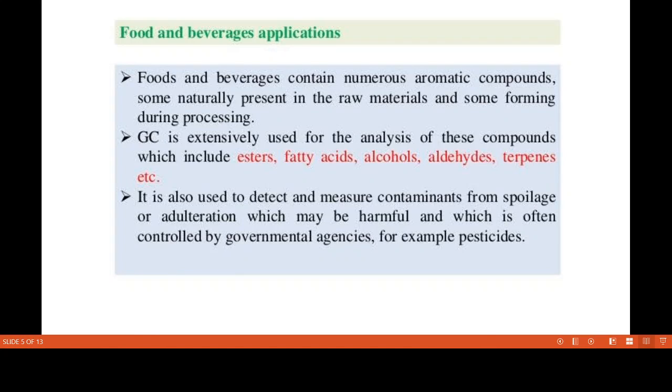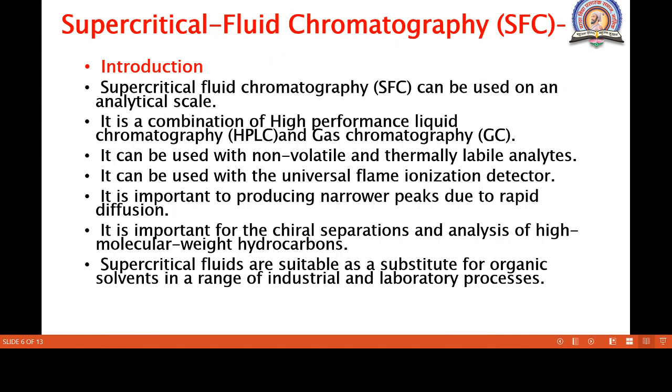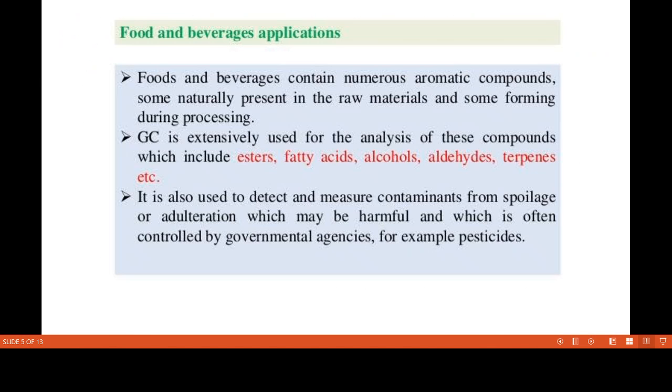Food adulteration is a very serious issue in day-to-day life, so that can be addressed by using this gas chromatographic technique. Okay, so with this we complete the gas chromatographic technique.